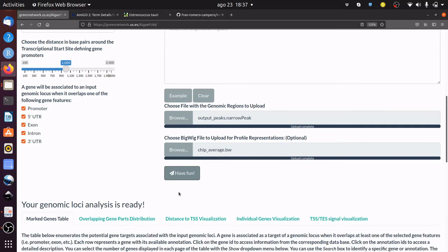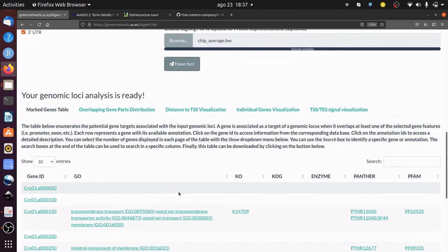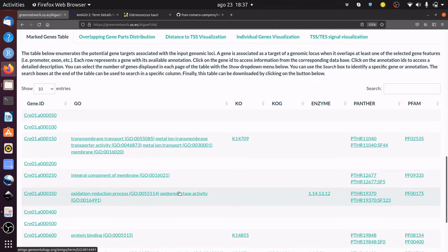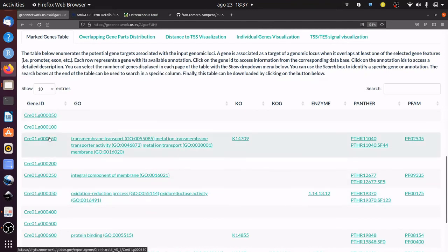The results are shown in different tabs. The table with potential gene targets can be explored by clicking on the different links or downloaded for further analysis.